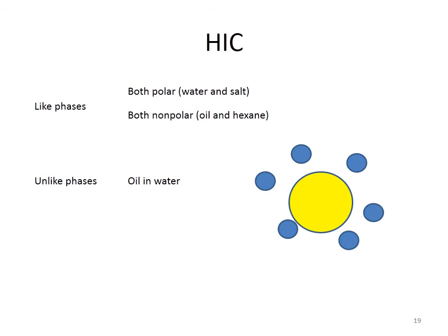Proteins contain several different types of hydrophobic amino acids. Certain amino acids have aromatic groups on them. Other amino acids have aliphatic hydrocarbons on them. So these aliphatic hydrocarbons or aromatic hydrocarbon side chains are non-polar groups.